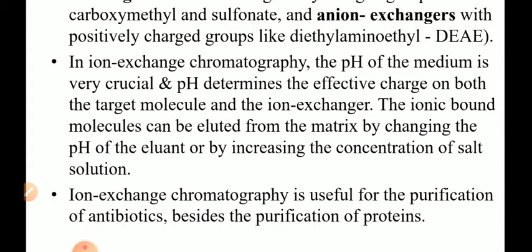Okay. So your product which is bound to the ion exchanger is eluted out by changing the pH of the eluting solvent or by increasing the salt concentration. Ion exchange chromatography is useful for purification of antibiotics and some proteins.